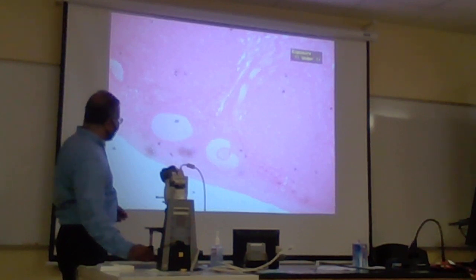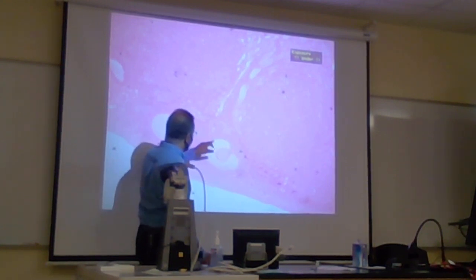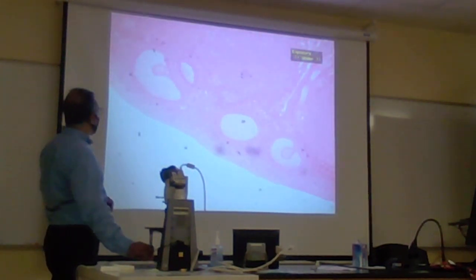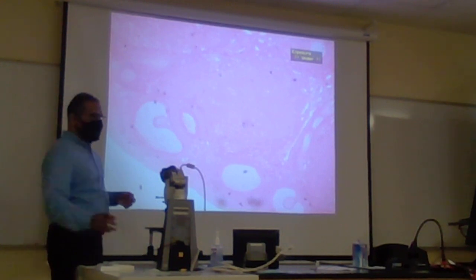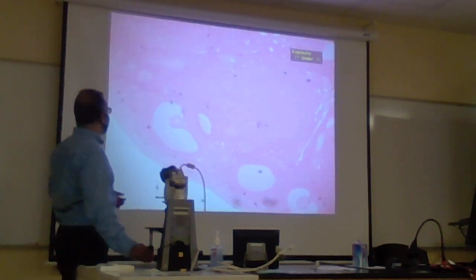Again, you see the same organization here: oocyte, the zona pellucida, the corona radiata, the granulosa, the thecal cells. Also cats and dogs, and rats, could have multiple Graafian follicles because they can have multiple babies at the same time.